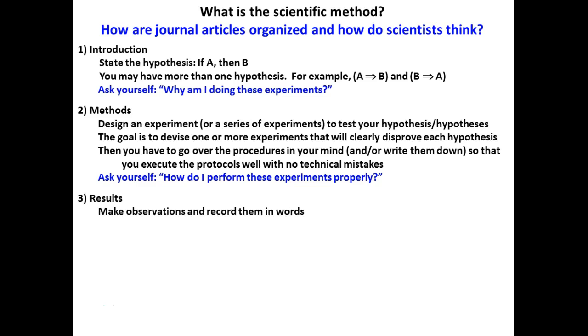Results. What are our observations? Commonly, we're going to draw things as you saw. Trying to get you guys to be good recorders of your evidence. Taking pictures is fine too, and we did that last time. Drawing, documenting, writing.